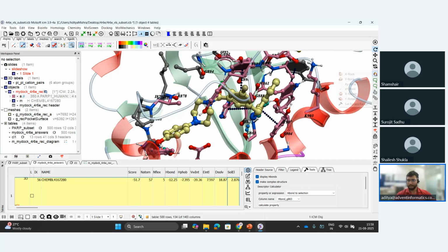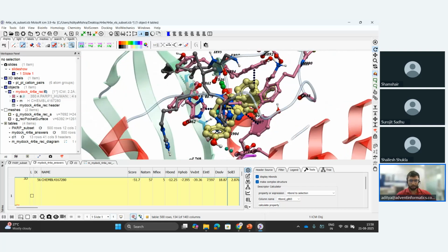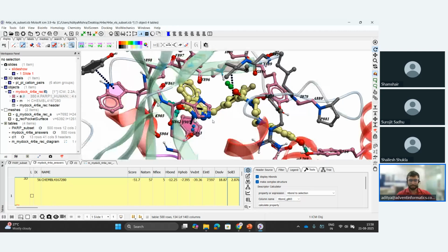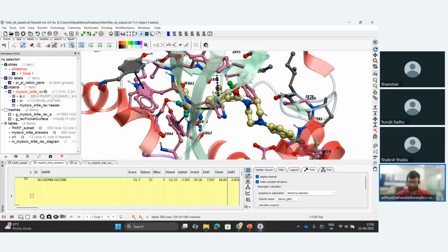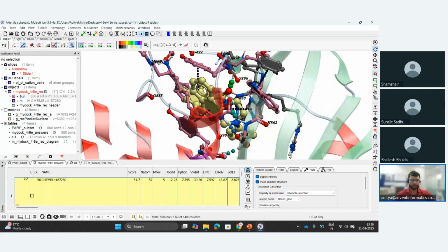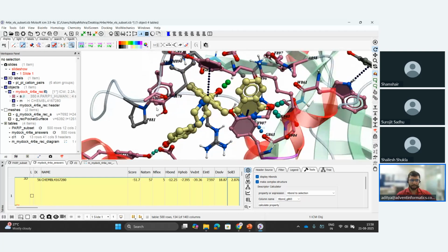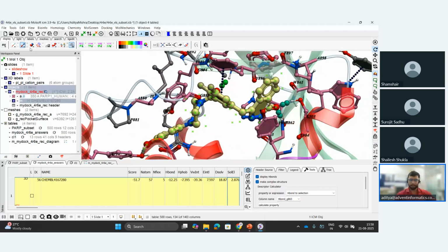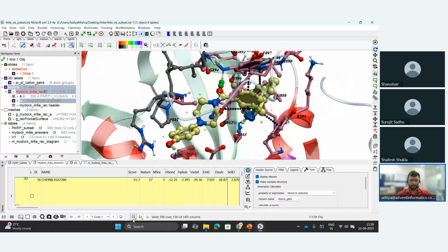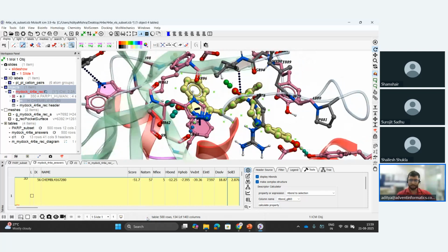For example, let me just start the rolling option. And when I click this record button, it will start recording my screen, right? It will record my cursor if I want to. It will record anything if I want to change the representation, if I want to include or eliminate anything, if I want to make a blob around. Everything I do now will be saved. This is the smooth transition button, and at last this is the save button.